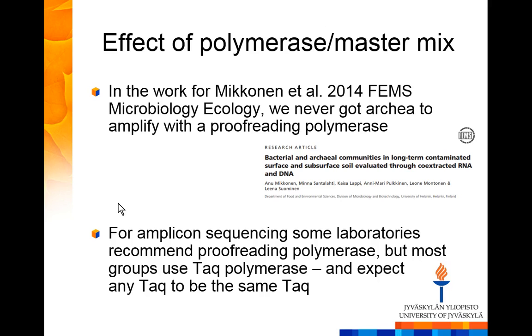I spent 10 months at Noah Fierer's group at the University of Colorado in Boulder, which is probably one of the biggest or best-known groups doing environmental microbiome analysis. For example, in that laboratory, they use Taq polymerase, or actually a ready-made commercial master mix. And when one commercial master mix didn't work well, or there were problems with delivery, they just changed to another commercial Taq-based master mix.